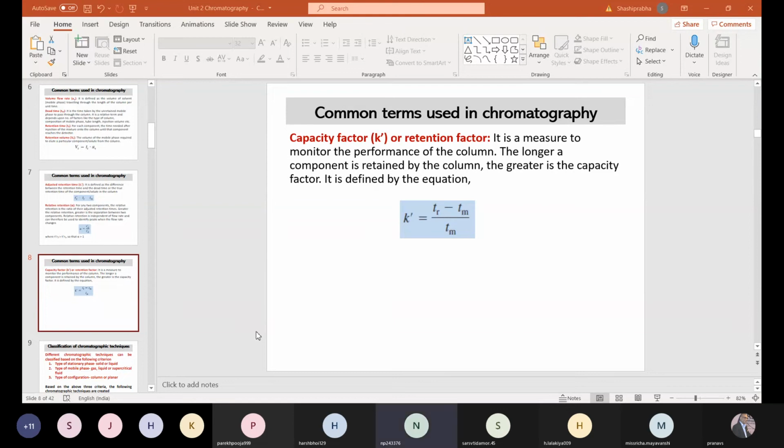No, sir. Very good. See, chromatography, it doesn't change. Only the way in which we express or we teach, that might be different, but the things remain the same. And that is how one should look at chromatography to have a better understanding. Most important thing in chromatography, of course, once you have optimized the method, second is interpretation. Without interpretation, it has no value, because all chromatograms look the same.